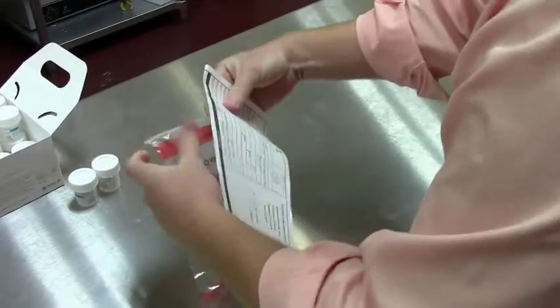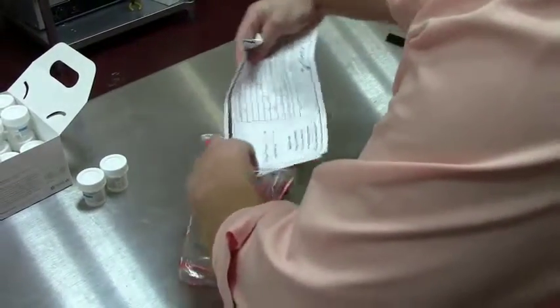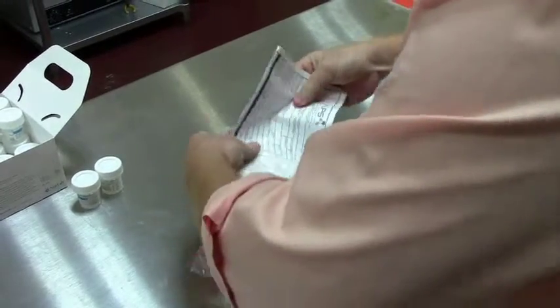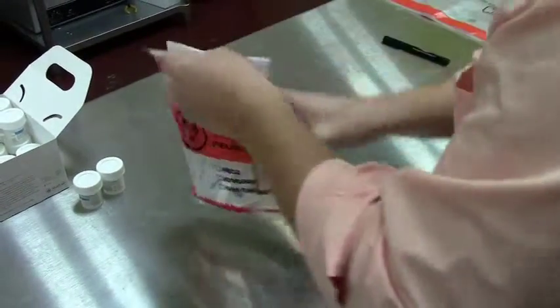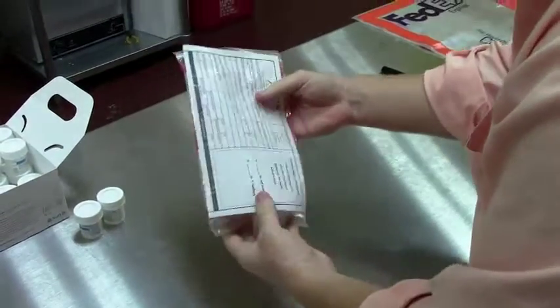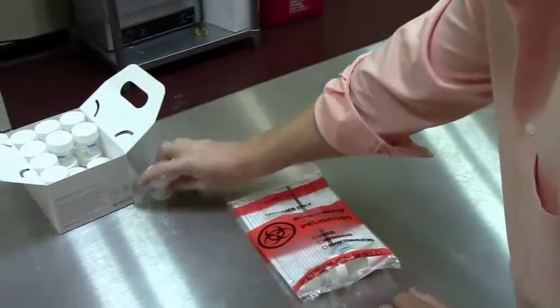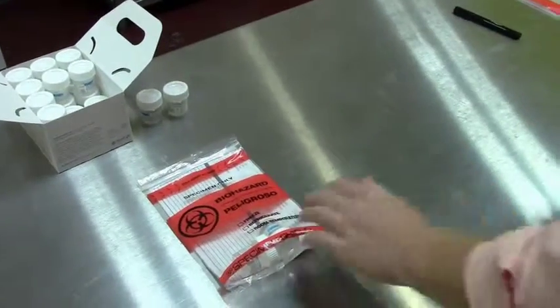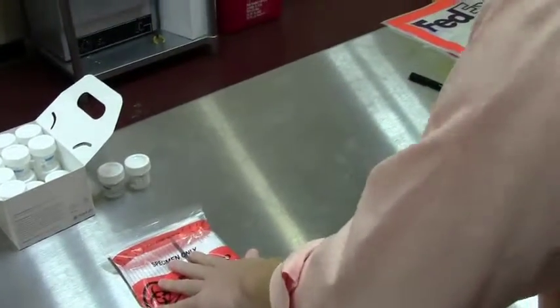there's a pocket in the back of the bag. You just place that in as so. So each patient you have will have its own separate bag. So when they get to the laboratory, we can pull it out and we can line them up as they go in numerical order.